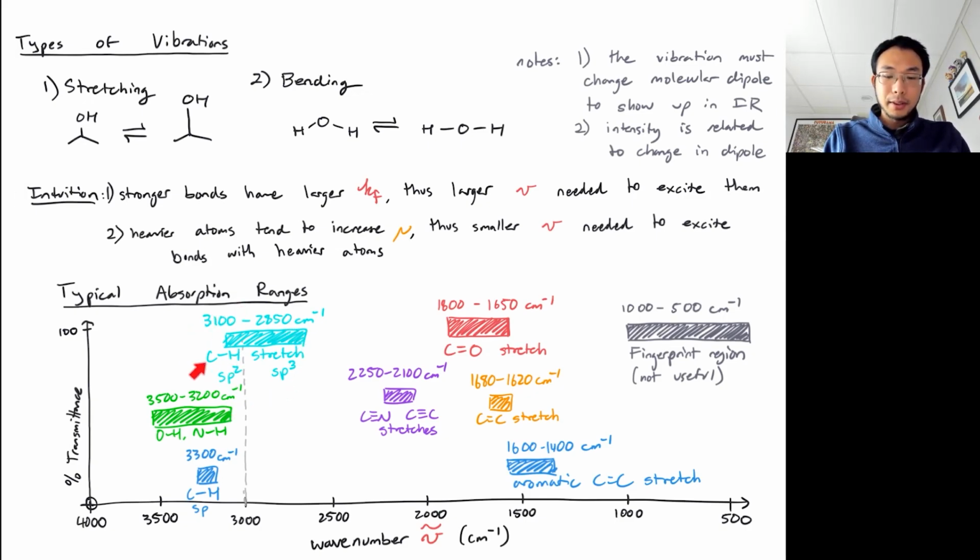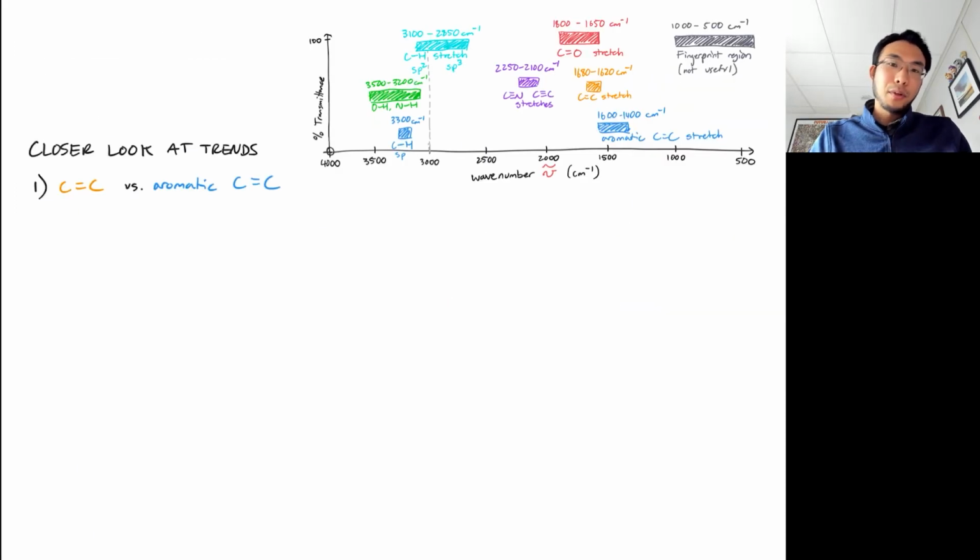What you have in this 3000s range is where all the various hydrogen-to-something-else bonds are showing up. I think you can appreciate, just by looking at this simplified version, that there are some places where you can expect to see things, but at the same time it's not going to be immediately obvious whether you're thinking about a CH stretch or an OH stretch, because their ranges overlap.